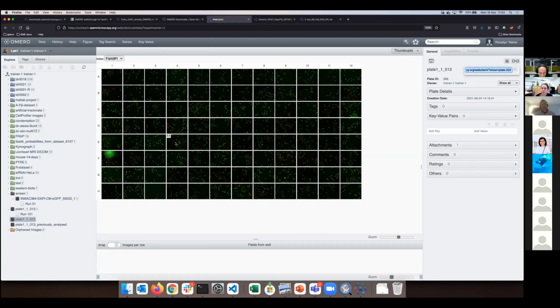Yes, thank you. That is absolutely crucial, what Jean-Marie just said. We assume in this situation that we all have an account on that server. This is number one. Number two, that we are allowed inside the permission system to see that particular data. How to not be allowed by the permission system, that's very easy. If you are not a member of the group where the data are, typically you are not allowed to see them. That's as easy as that. So these are all the assumptions which we are making here. And it's a question of security, but also accessibility and sharing, and we can go into that more if you like.